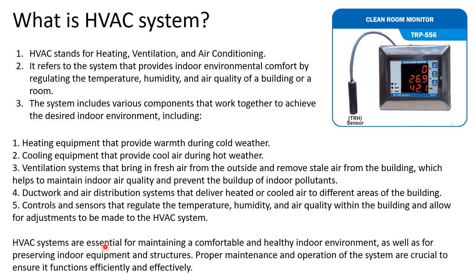Okay, and depending on that the adjustment in HVAC can be done. Now HVAC systems are essential for maintaining a comfortable and healthy indoor environment. For example, for a microbiologist, if in a clean room you are working with, say, isolation, or you just want to check the microbial load in your non-sterile product that your company is manufacturing.